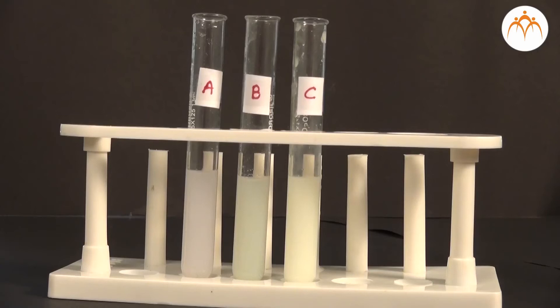In test tube A, precipitate formed is white in color. In test tube B, precipitate formed is light yellow in color. In test tube C, precipitate formed is dark yellow in color.